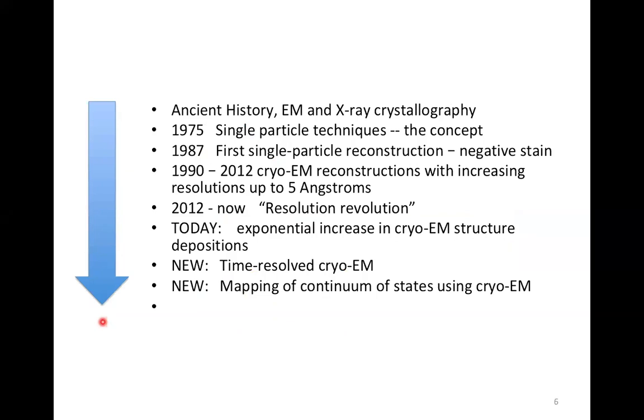So in my talk, I'm going to talk about the ancient history, EM and X-ray crystallography, then the single particle techniques, the concept, and the first single particle reconstruction, and then cryo-EM reconstructions once cryo was invented, with increasing resolutions up to 5 angstroms.